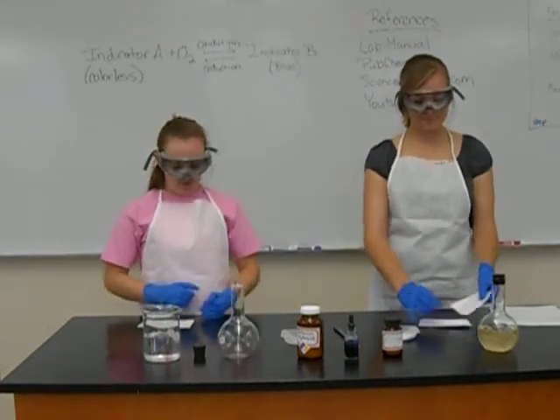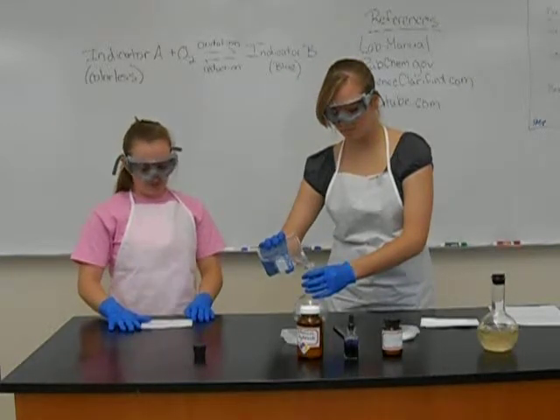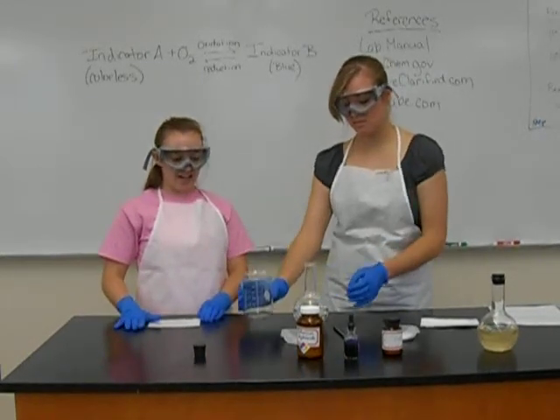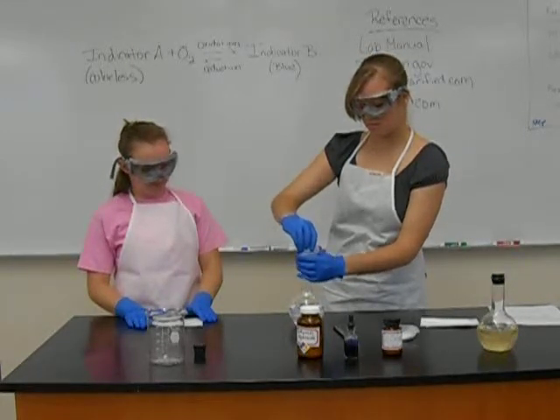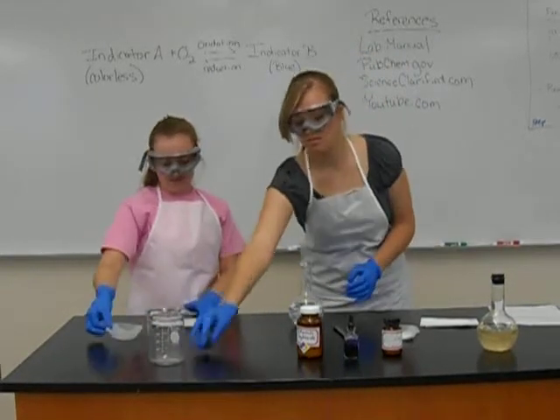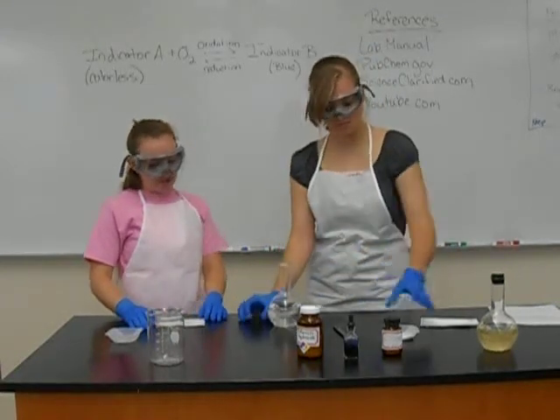So to start off, we're going to add our 300 milliliters of distilled water into our Florence flask. We're going to dissolve the potassium hydroxide into the water. And we'll shake it up to make sure it dissolves evenly. And finally, we're going to add the 10 grams of dextrose.